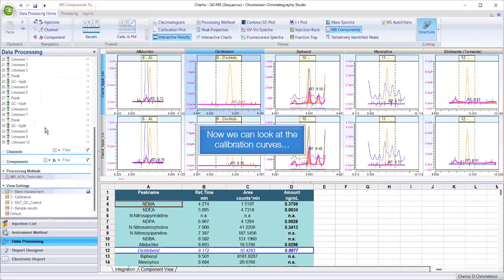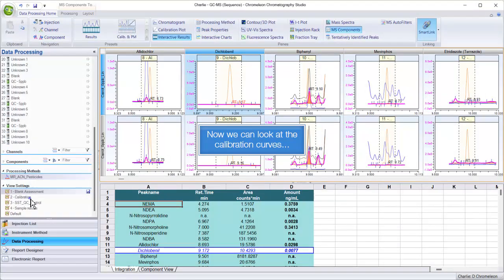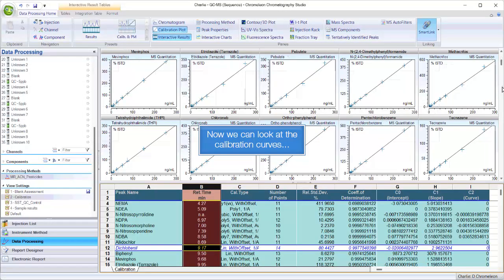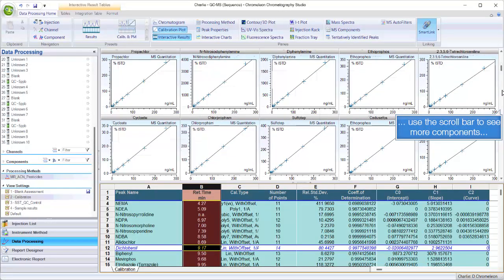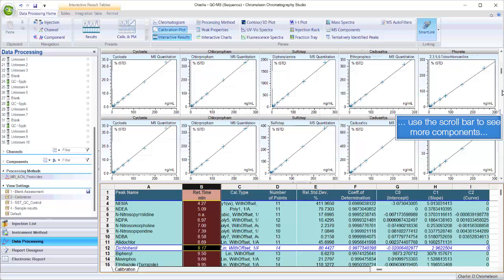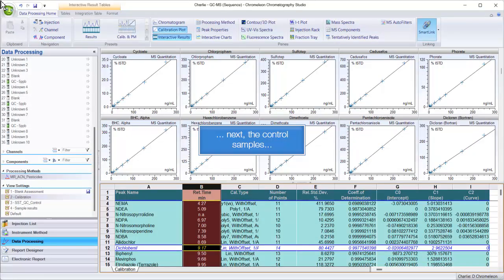Now we can look at the calibration curves. Use the scroll bar to see more components. Next, the control samples.